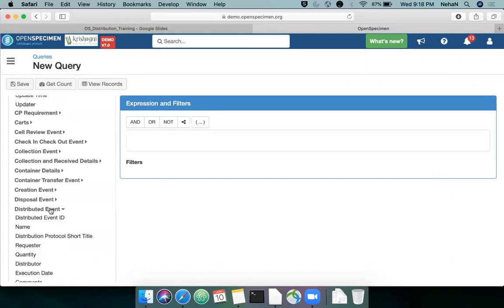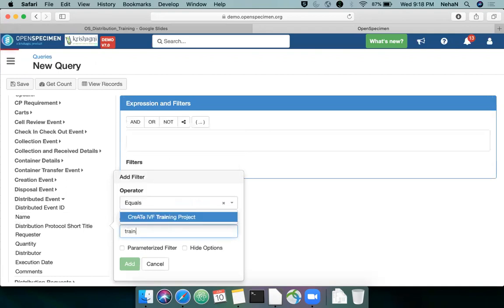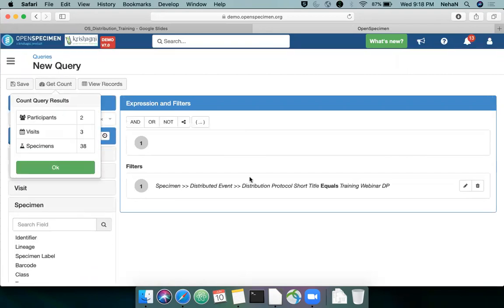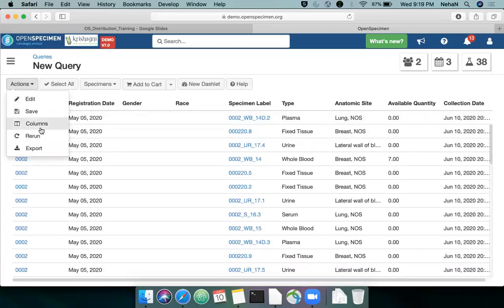You can query based on the distribution event. Say I want to know all the orders that were distributed under the training webinar. Here it says that I have given away 38 samples. You can add more filters based on what information you want and populate the results.